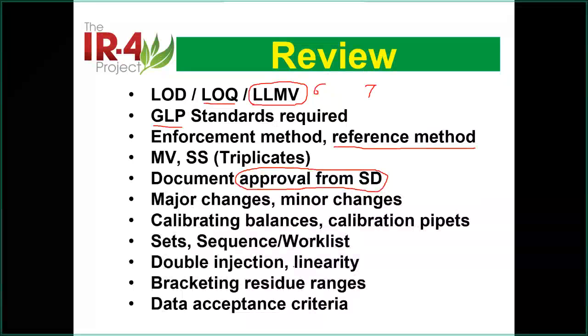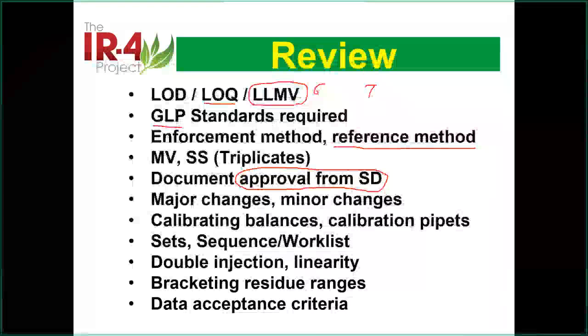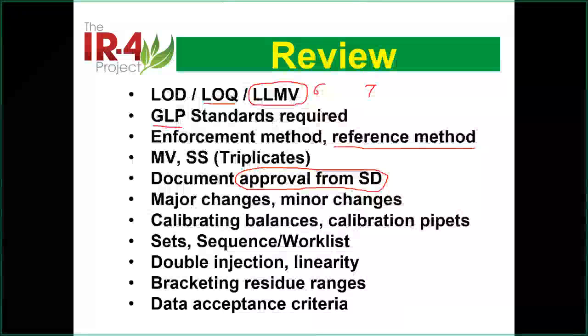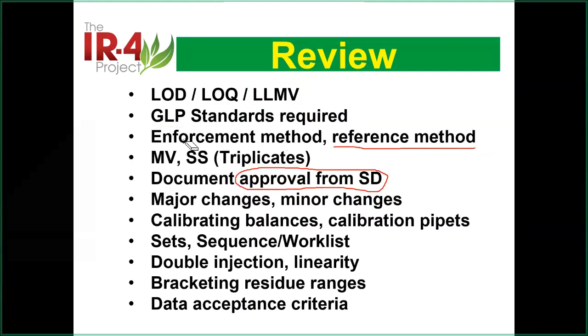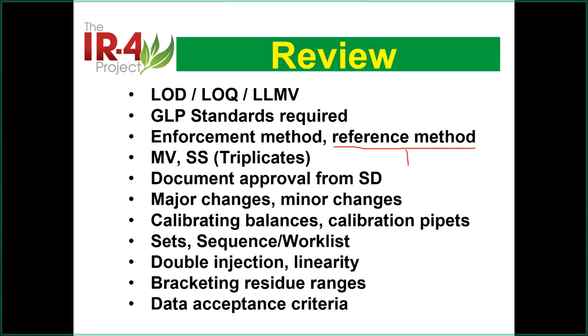Because we talked a lot about the method, the next thing is when you don't use the exact method: what's the change, and is it accepted? So here is the reference method. Then you have your own working method, and what's the change? That could be very minor, small, or very major.